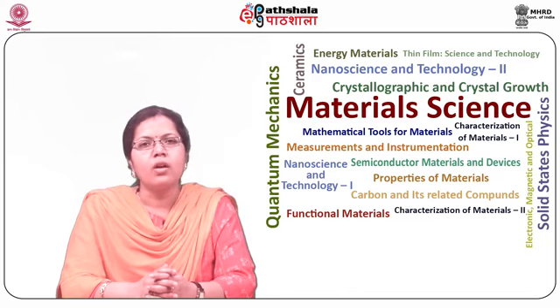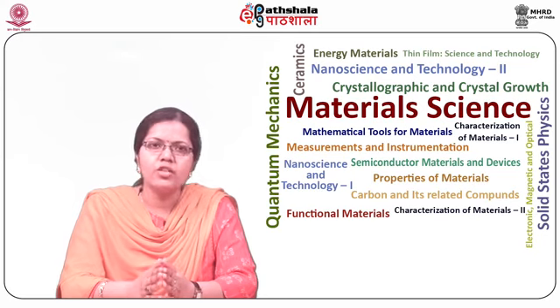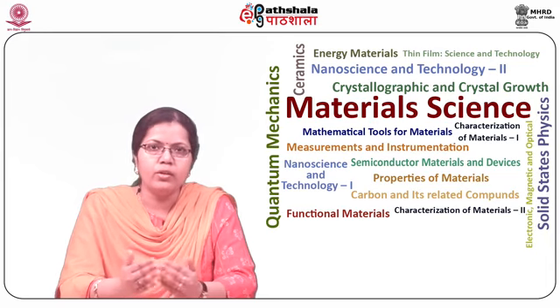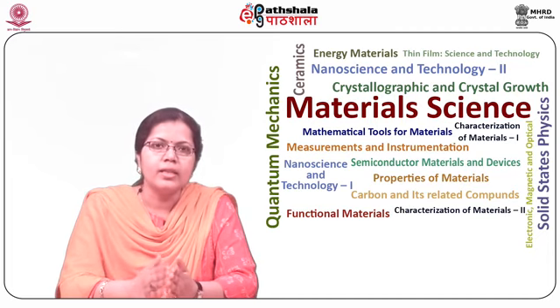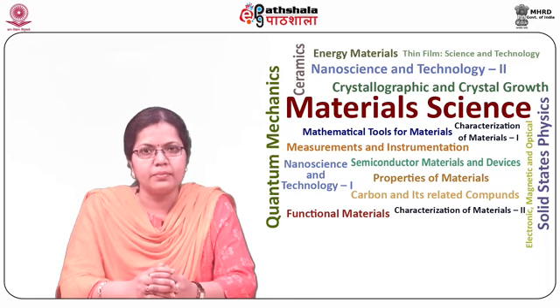So students, all liquid and solid materials experience change in optical properties with variation in the wavelength of the light employed to measure them. This variation in properties as a function of wavelength is called the dispersion of the optical properties.